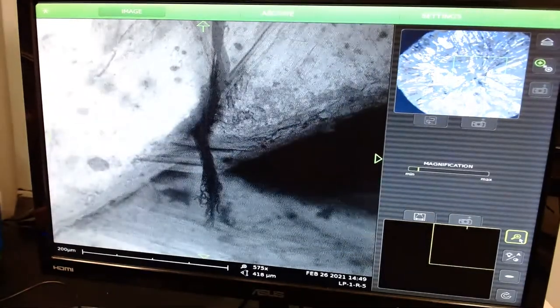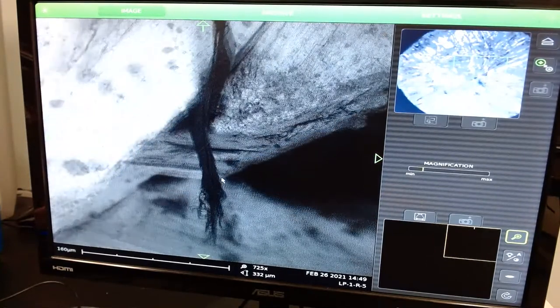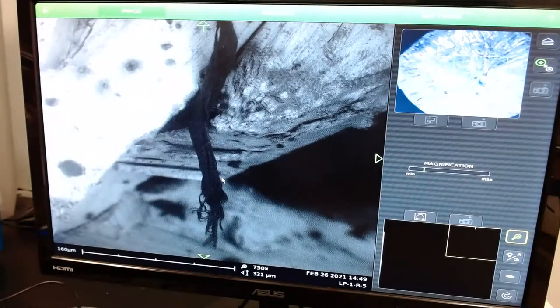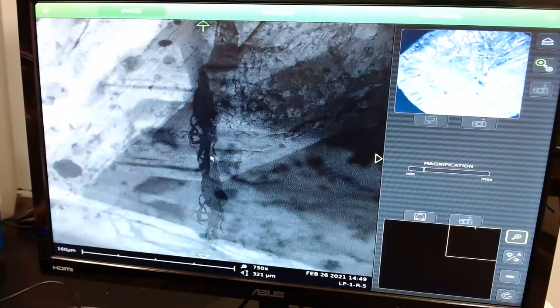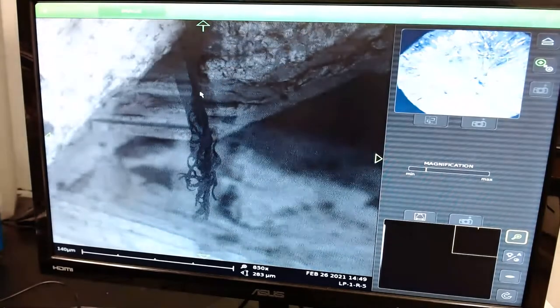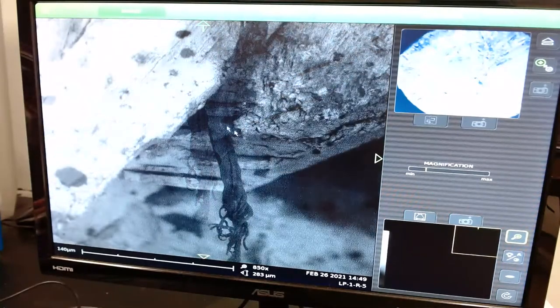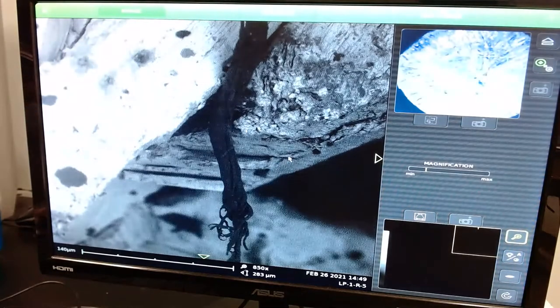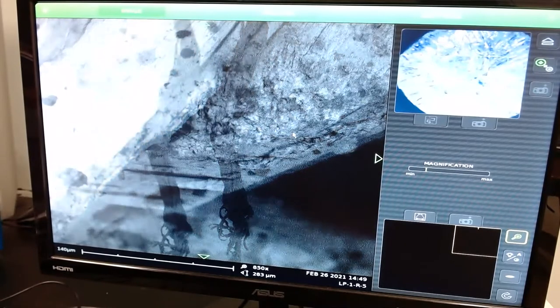What's that right there? I have no idea. It looks like a hair follicle or something. Anyway, you wouldn't have been able to see that little dingleberry if you didn't have an electron microscope. Dingleberries are technical terms. Look at that right there. I mean, if that's not a zinc dingleberry, I don't know what it is. I actually don't know what that is. Is it like a hair thing? Yeah, it looks like it's probably some sort of skin or hair flake that fell into the sample. That's obviously not a zinc crystal.